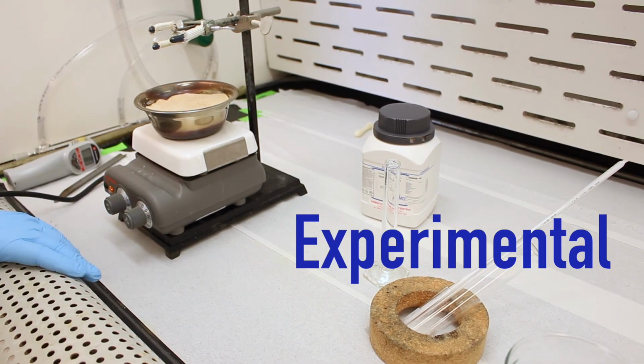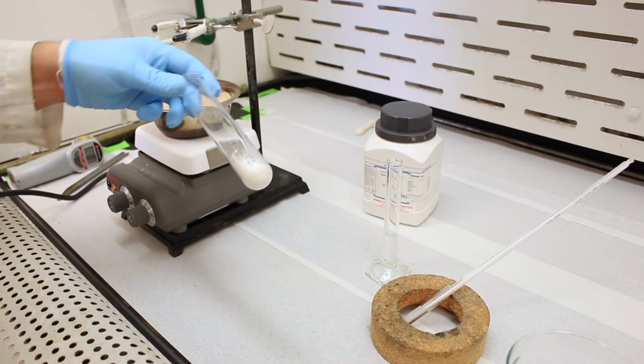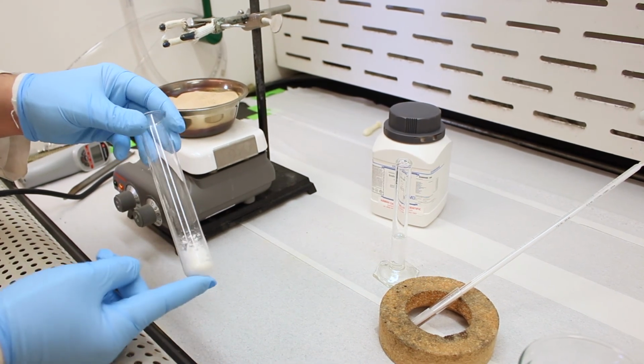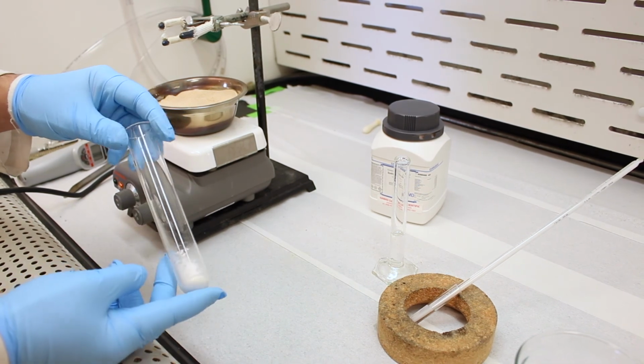Alright, welcome to the experimental of the double dehydrohalogenation experiment. So here's our reaction vessel. It's very simple for this lab. It's a glass tube with 1 gram of our 1,2-dibromo-1,2-diphenylethane. This is the product from the last experiment.